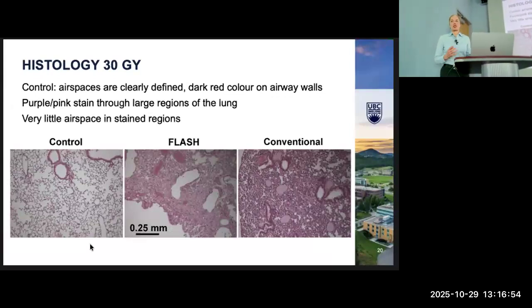So I purposely am showing kind of the worst things that I found. Their whole lung doesn't look like this because they wouldn't be able to breathe at all. But this is just kind of the worst thing that it looks like.